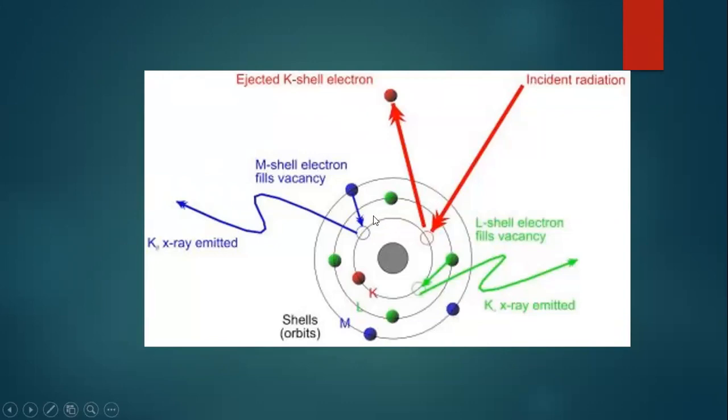So then the X-ray beam is emitted. You can see that the X-ray will be emitted from the front end of the handheld X-ray analyzer. And what will happen is that the X-ray beam will interact with the atoms in the sample by displacing electrons from the inner orbit shells. Here are the orbit shells we have.